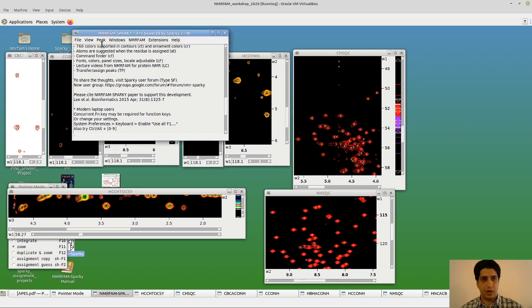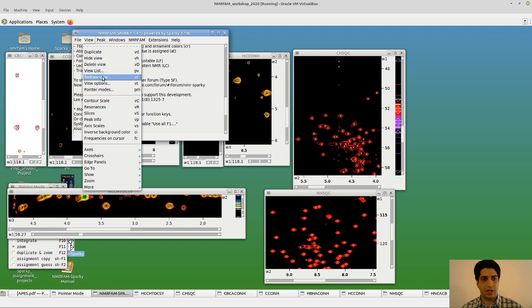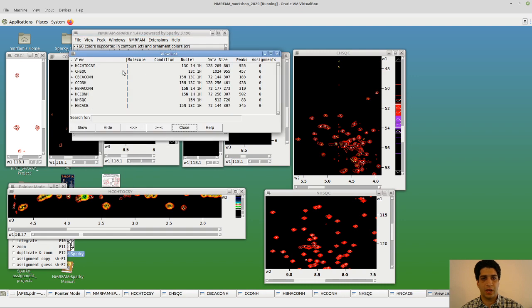So go to View, and then go to the view list as we did the last time, and you can see all the experiments, and this time you can see that APES has found many peaks in each of these experiments.